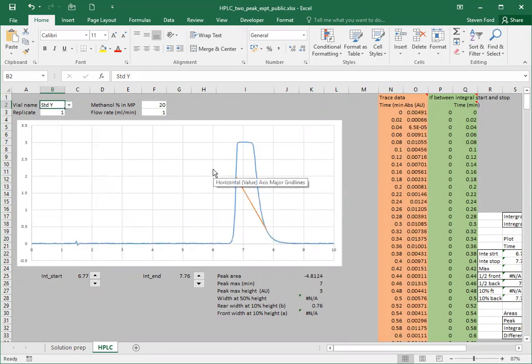So yes, you can see here that we've actually built a linearity function into the HPLC absorbance, so that if students didn't prepare the correct solutions for the linearity experiments, then they would actually see the normal curves that we would see if they'd exceeded the dynamic range of the detector.